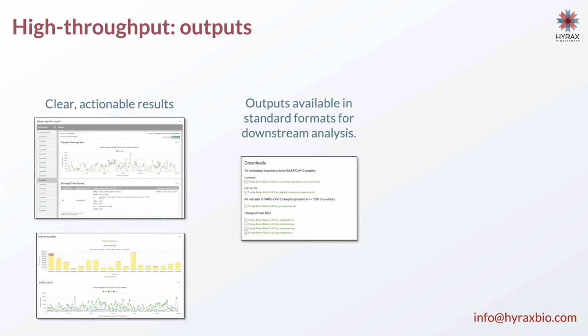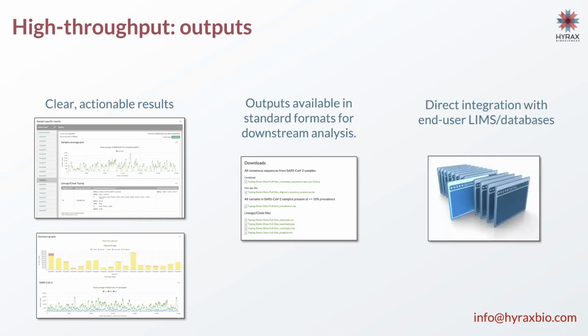So really what we try to do is have the outputs available in as many formats as possible for continued use. One of the other key things is that we have an API in the back end as well, which enables direct integration with LIMS systems. So there is a way where data can flow directly off the machine into Exatype, the analysis can happen, and the results can be presented to an end user LIMS with zero end user interaction. That's really where we're striving to go with Exatype as a product, but it is possible to be done on many solutions.